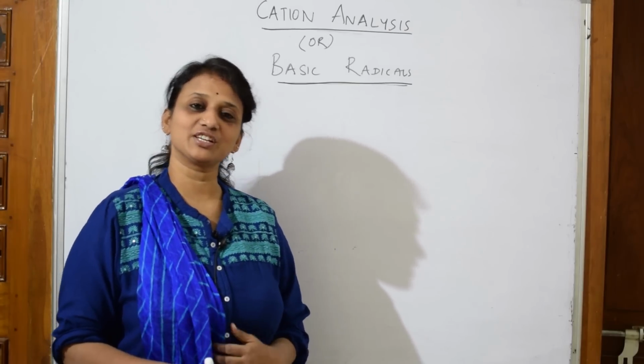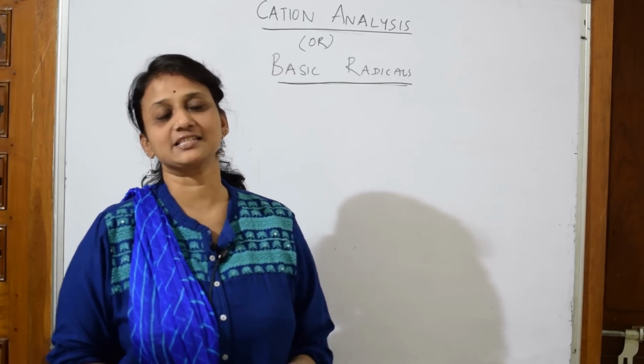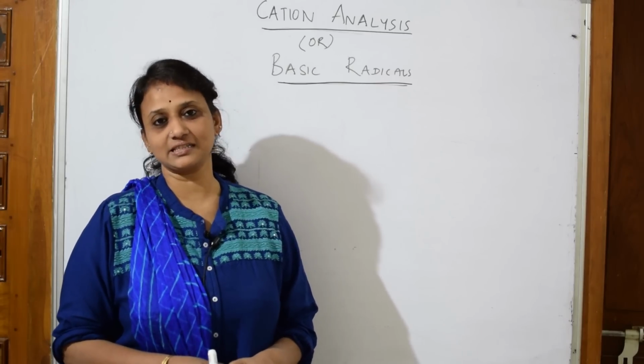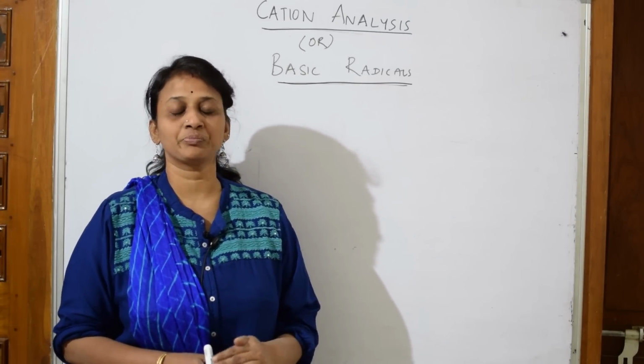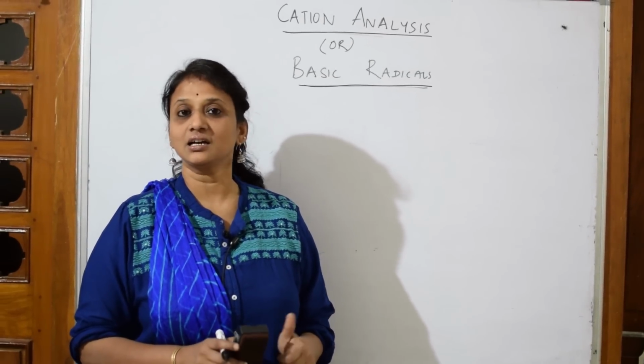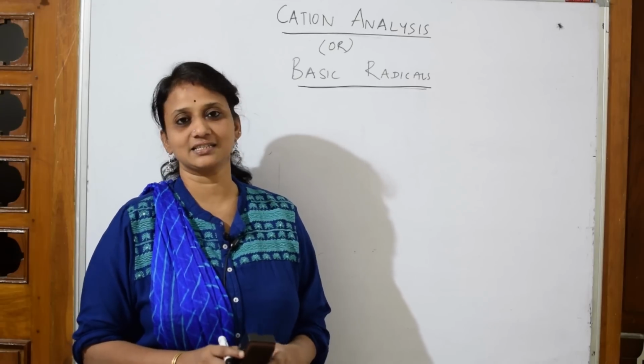So welcome back students to one more session of your qualitative analysis. So what did we do in the previous video? We have studied the anion analysis, isn't it? Let me recollect what I did. I've completed analysis of class 1 acidic radicals, class 2 acidic radicals and class 3 acidic radicals.